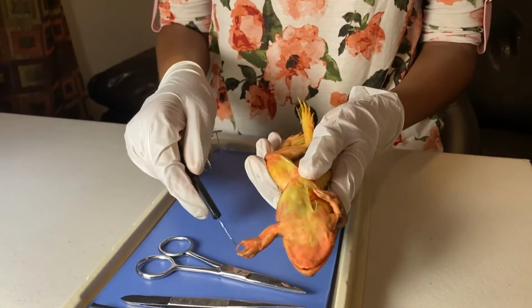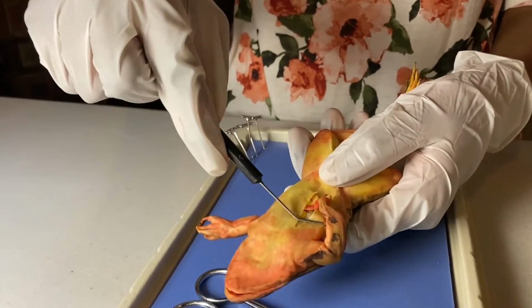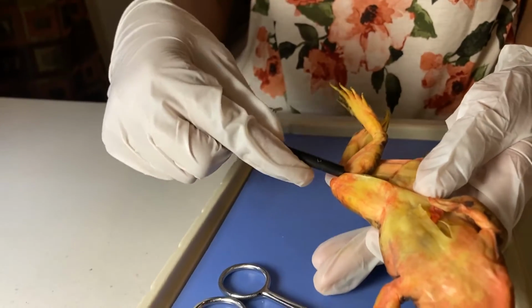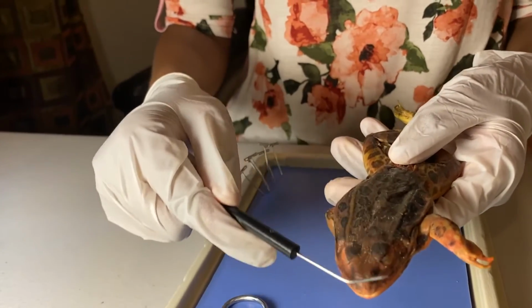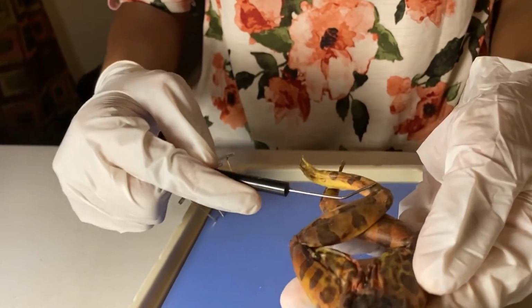On the ventral side, you can see the four limbs. These are the two forelimbs, and you can see the two hind limbs. The front of the frog is the anterior position, and the back of the frog would be posterior.